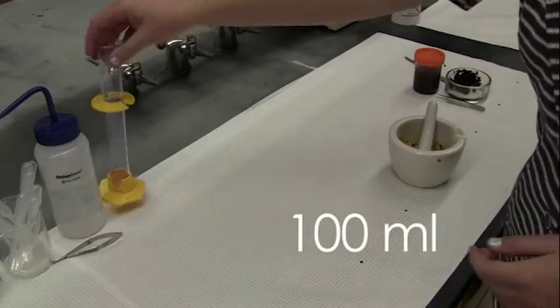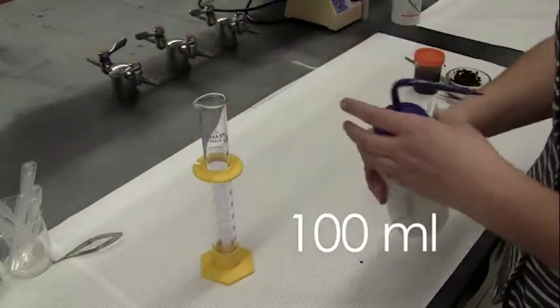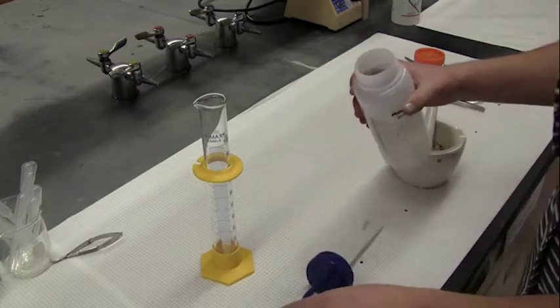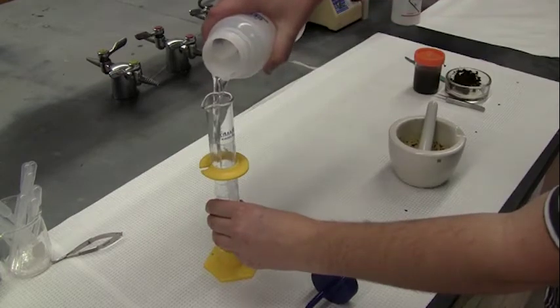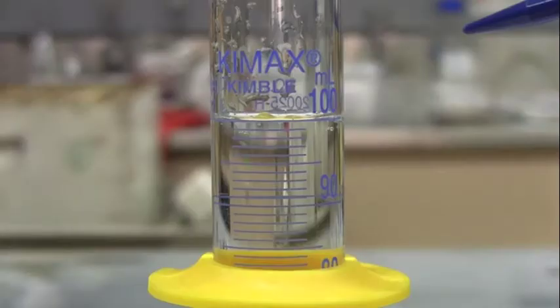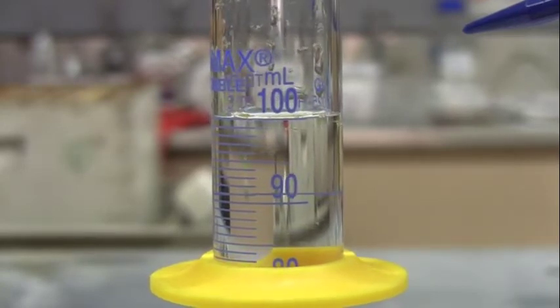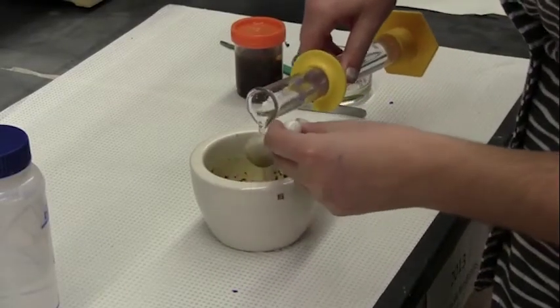Measure out 100 milliliters of deionized water using your graduated cylinder. If your sample doesn't contain exactly 100 abdomens, add 1 milliliter of water per each bee of your sample. The water will curve at the surface when poured into the graduated cylinder. Make sure to measure using the bottom of that curve. Pour water into the mortar.